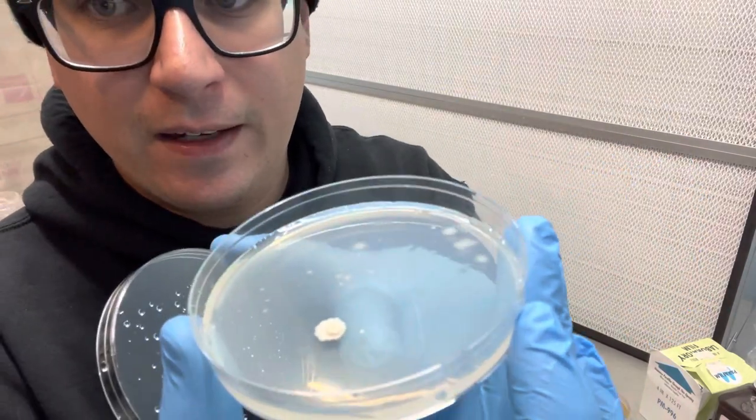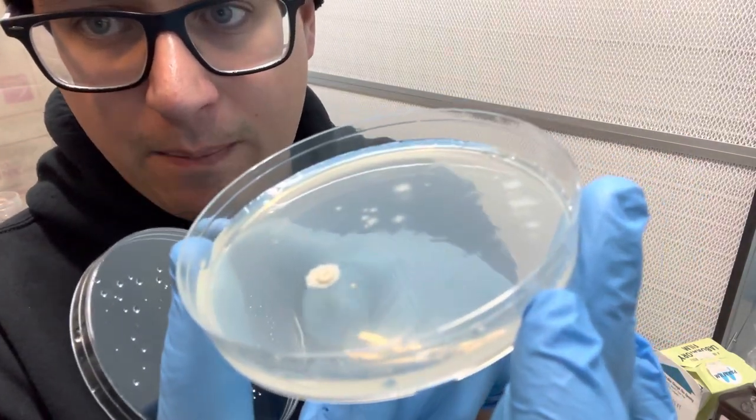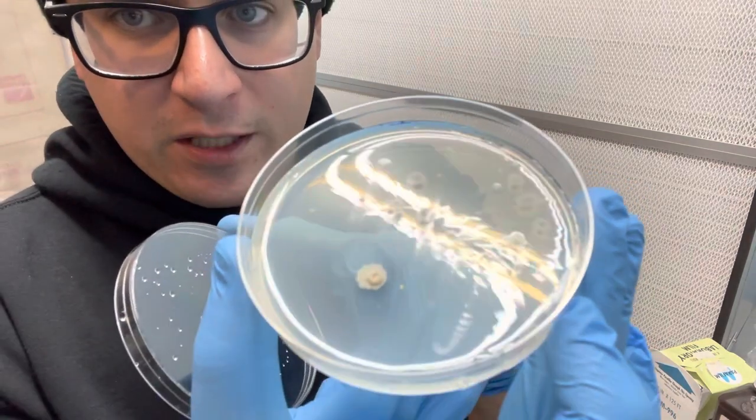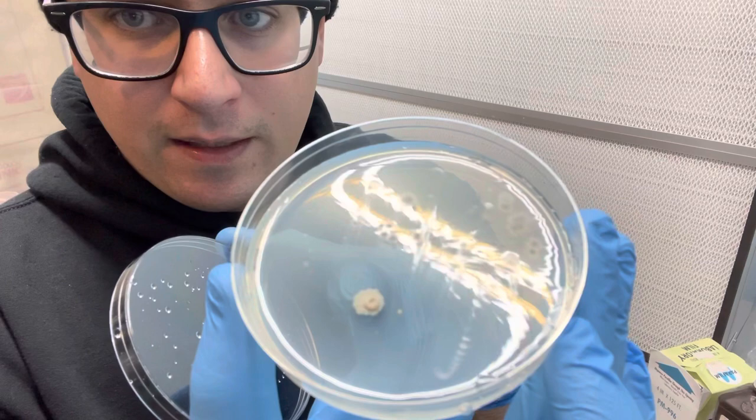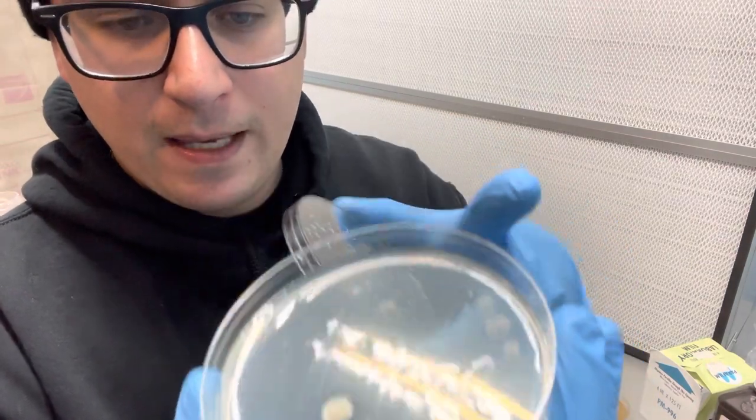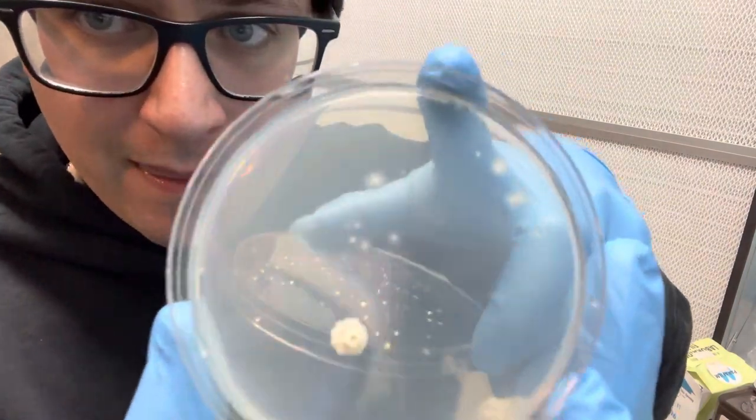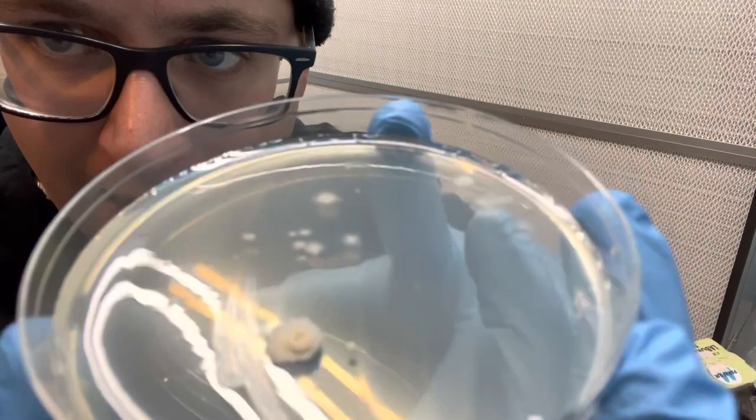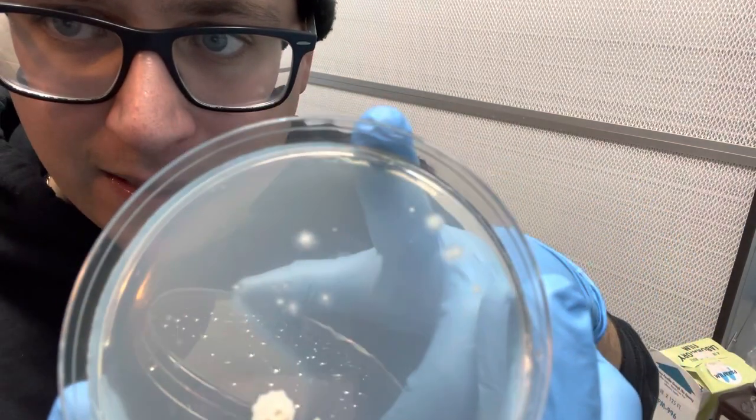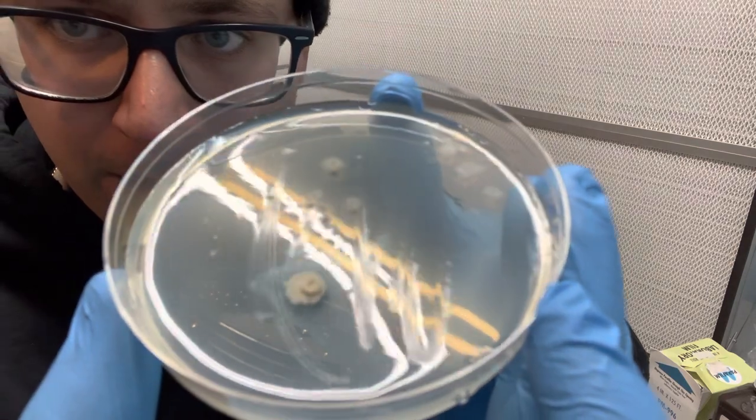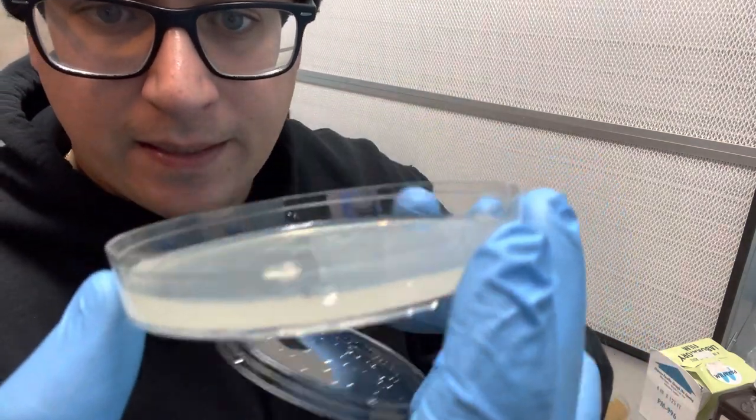There's a tiny little colony right next to it which looks like the same bacteria. This was from a streak plate—you can see the different lines from when I streaked out the spores. Up here towards the top, that is mushroom mycelium. Notice how thin and filamentous it is, it's more irregular in shape.